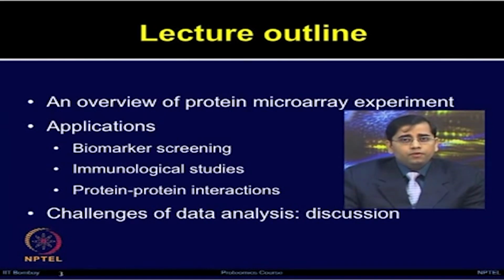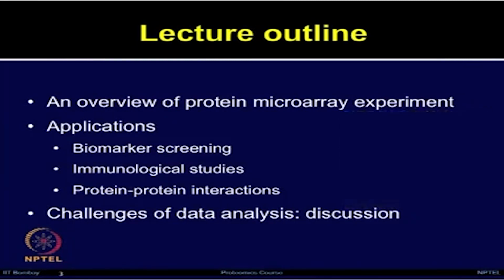Finally, we will touch upon the challenges of analyzing the microarray data, regardless of whether you are performing an experiment to identify protein interactors or looking for new biomarkers. The microarray experimental setup provides a very high throughput platform and generates data for thousands of features simultaneously. Therefore, analyzing such data becomes very challenging. So, these three points will be discussed today.